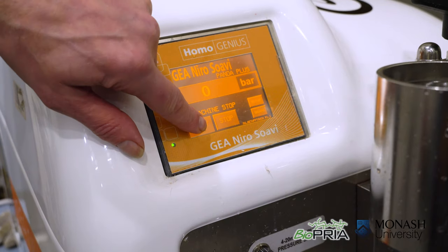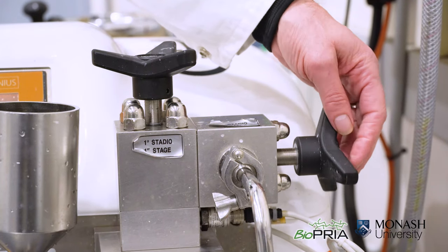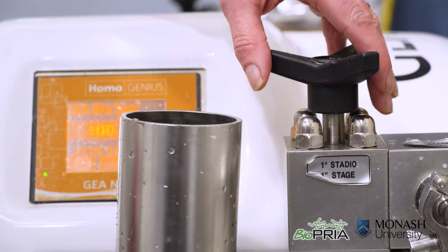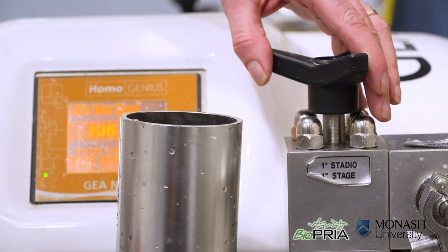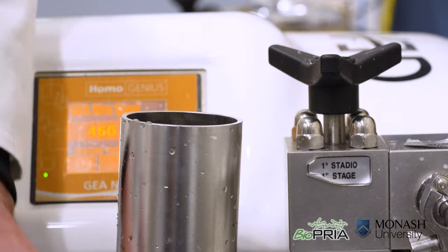We will slowly increase the pressure of the homogenizer. In the first stage we will increase the pressure to about 80 bar. In the second stage we will slowly increase the pressure to about 800 bar. Make sure that there is water flushing into the homogenizer.